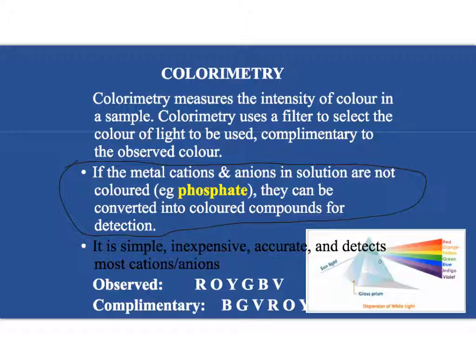So really good things about colorimetry, which is in this section here: it's simple, it's inexpensive, it's accurate, and it detects most cations and anions, which is awesome. So it's a really simple way of doing things.